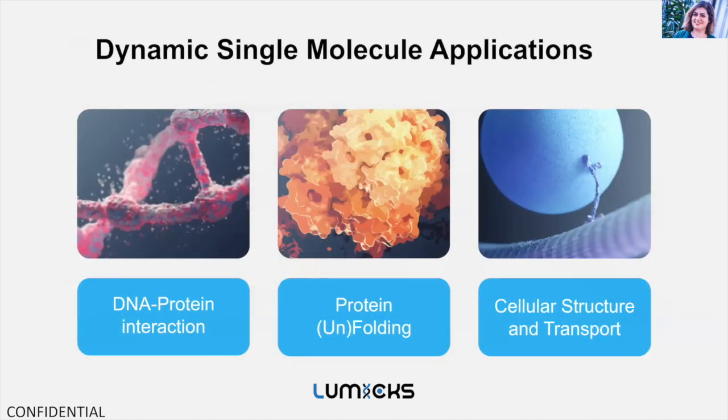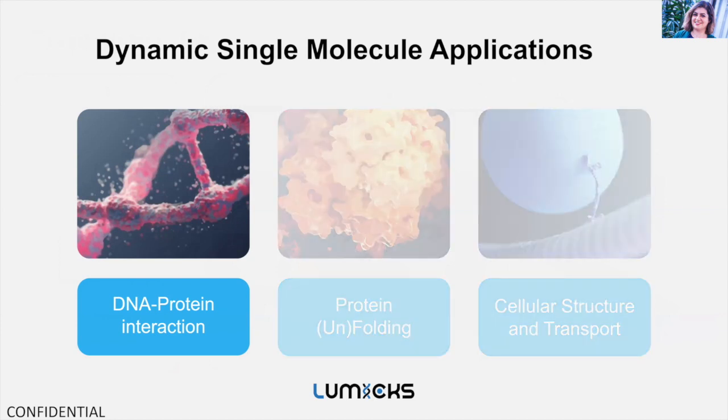So today I will go over a few applications of this technology for looking at DNA-protein interactions, but of course there is more that you can do. You can look at protein folding or unfolding, for example, or look at motor proteins acting on microtubules or actin.